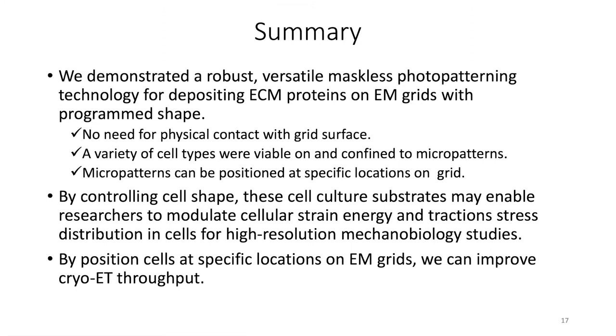We hope that this technology enables you and other researchers to structure in vitro cell microenvironments to correlate changes in nanometer scale organization at cell-cell and cell-ECM contacts to strain energy states and traction stress distribution in the cell. And by reproducibly positioning your cells at specific locations on EM grids, we hope that you can improve your cryo-ET throughput.